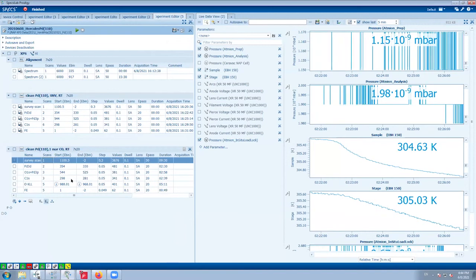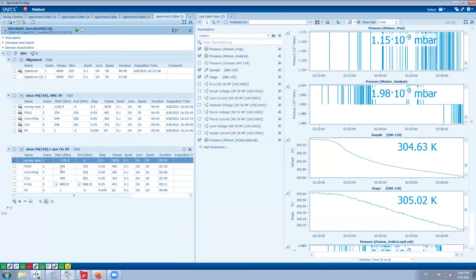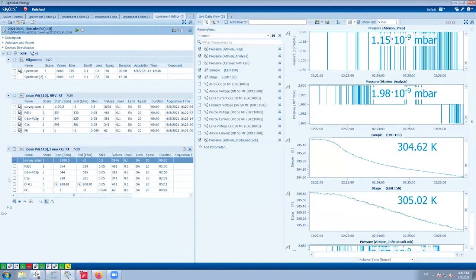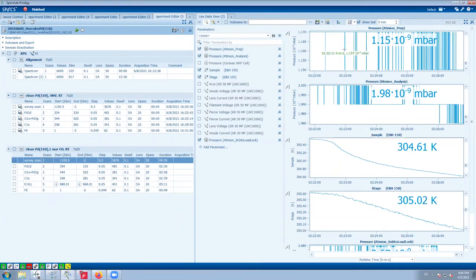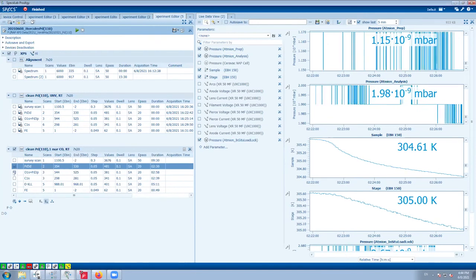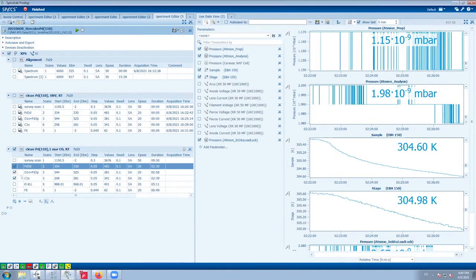Depends here, 45 minutes. I think it's not enough time to measure everything. I think it would be good to measure. We have to measure definitely the carbon region, which will be the most interesting, and maybe see palladium, it will also have maybe some oxidation. Okay, so let's switch on the oxygen again. I think oxygen is useless. Maybe 1 to 10. Sure.